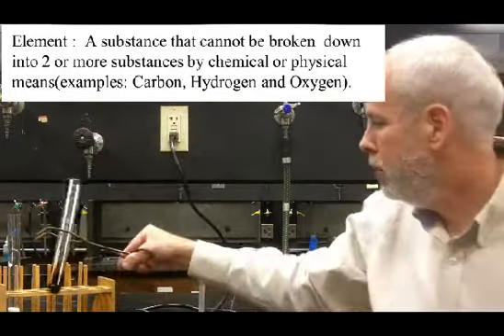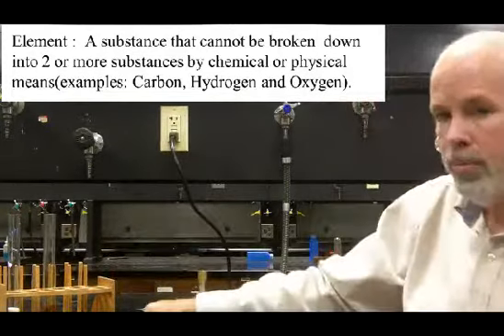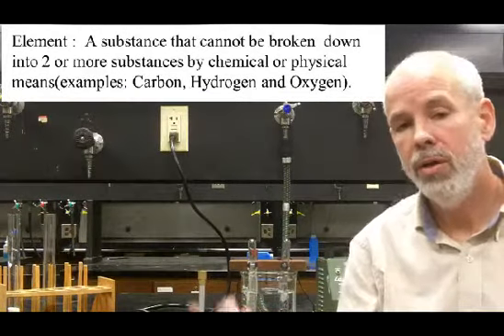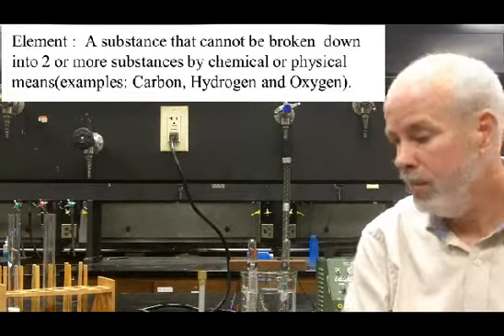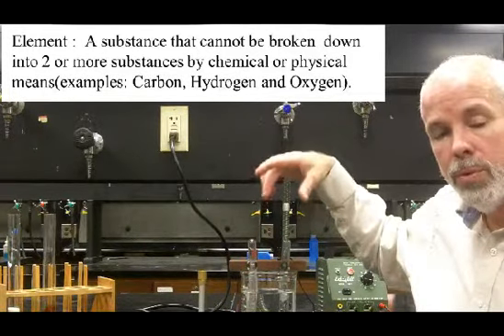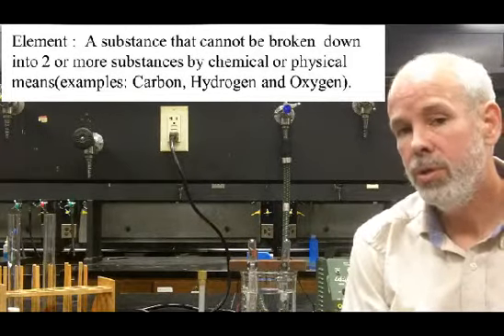Well, the answer is yes, we can. I've got a bunch more water in a beaker, and the wires are for putting electric current through the water. And I've done that already. And these upside down test tubes collect gas. Two gases are formed when you run electric current through water. Now the formula for water is H2O.